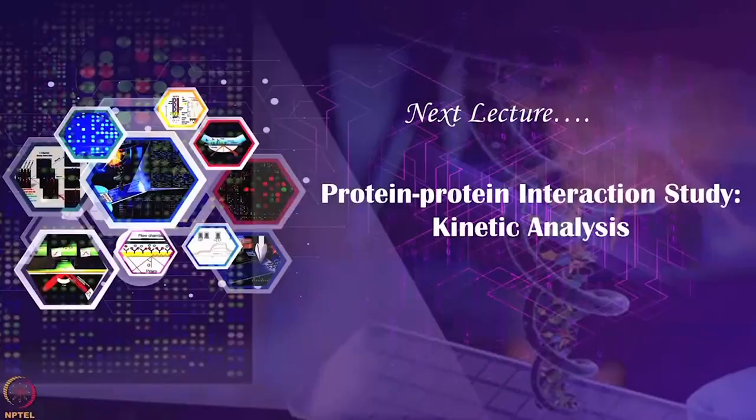I hope you are able to follow the lab demonstration sessions. These protein interactions are identified using a wide array of applications. However, what is also required is an understanding of the extent to which these interactions actually occur. Therefore, performing protein-protein interaction studies and calculating their kinetic values becomes very crucial. We'll continue the lab demonstrations and our discussion on SPR experiments for the kinetics analysis in the next lecture. Thank you.